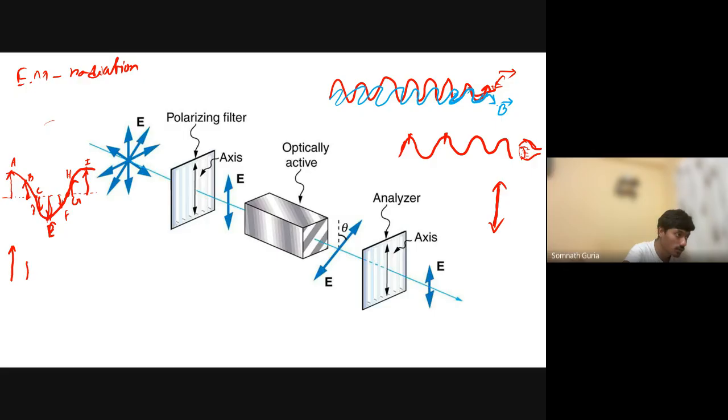We have the down direction, then the C point, then it goes to my negative direction, and there will be some maximum negative, followed by again it goes down, this will be my point, then again rises up, and the maxima over here.